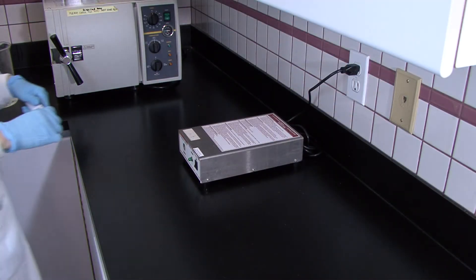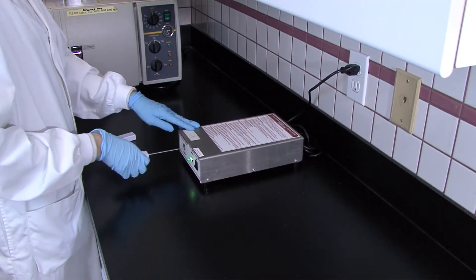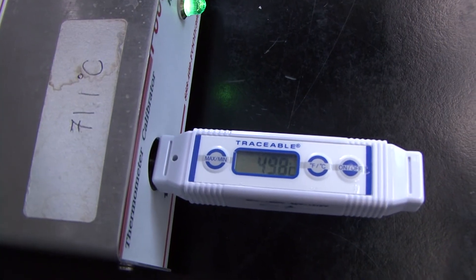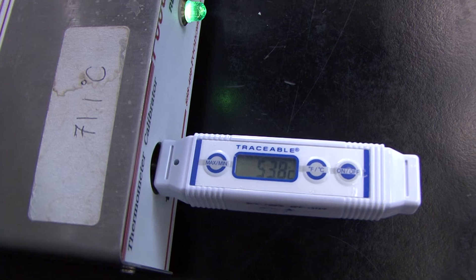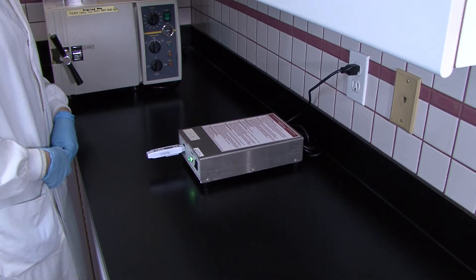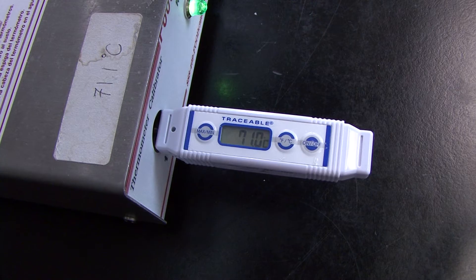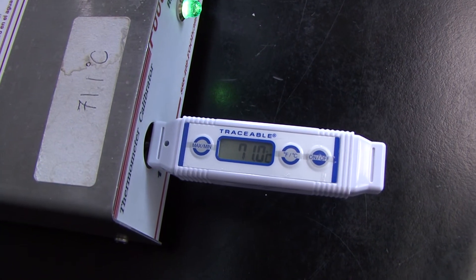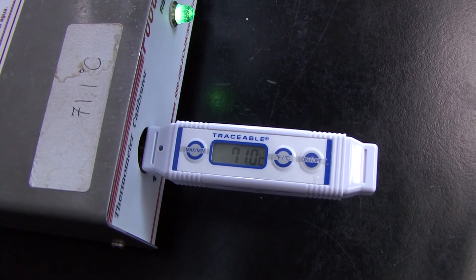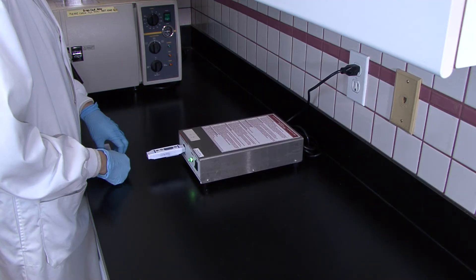There is a link to a sample calibration procedure that you can download and customize for your own operation. Some labs in food processing plants have calibration machines. Here a probe thermometer has been inserted, and it must reach a temperature of approximately 71.1 degrees Celsius to be considered a properly calibrated instrument. This thermometer reaches 71.0 degrees, which is within the acceptable accuracy range.